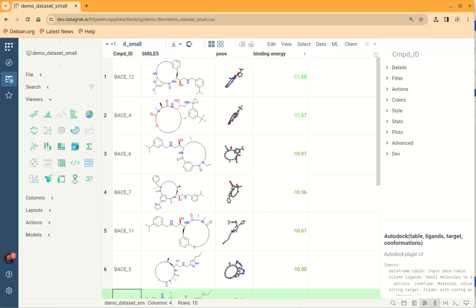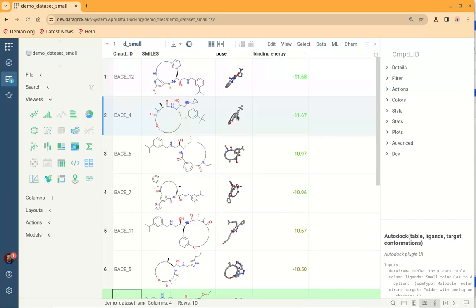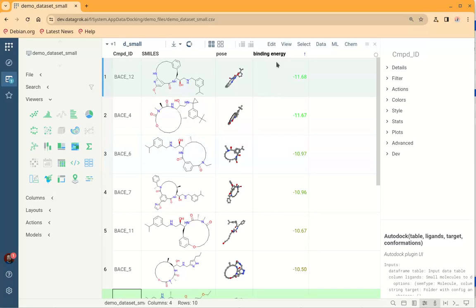After the docking process finishes we will see the poses of the docked molecules and the binding energy. The table will be sorted by binding energy from best affinity to worst.